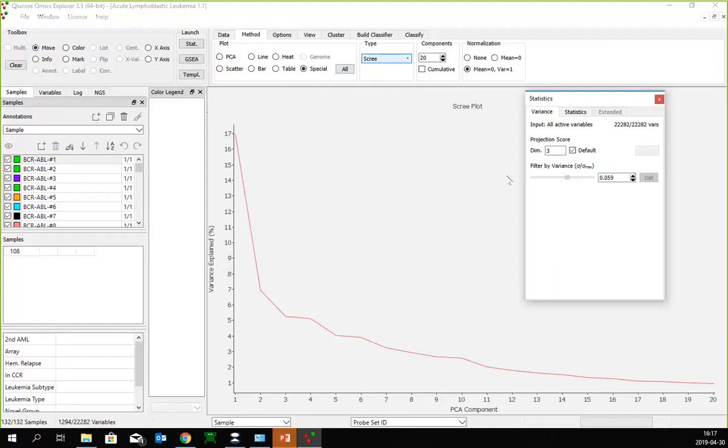If I move this back to where we started, we get the same numbers as we had on the PCA plot when we started. So it's 21% on the first one, and 7 and 5. And what we see here, which is interesting, is that the first three principal components contain very much of the information, about 33%, and the rest of it is here.